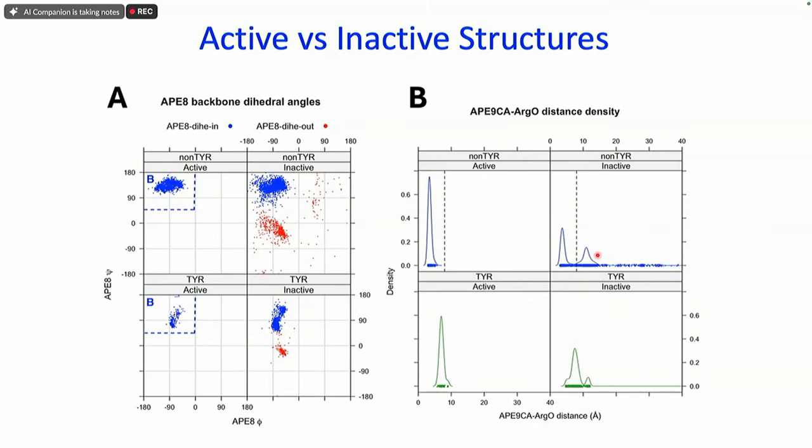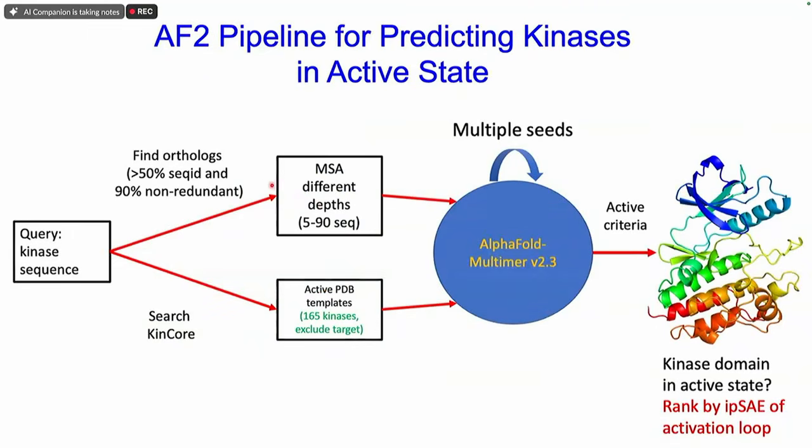There's a preprint online, but also the paper will be coming out soon in Biochemical Journal. And we have graphs for all of the different dihedral angles. So then we want to say, well, can we model all 437 kinases with AlphaFold? Because it would be really nice to have active structures. We have 111 out of 437. That's 326 kinases, I think if I did my math right, that we don't have active structures for, and we'd really like to know what those look like.